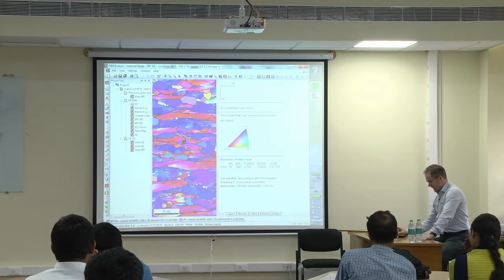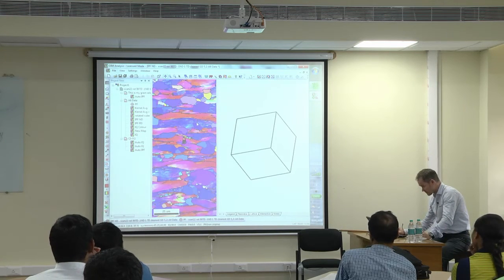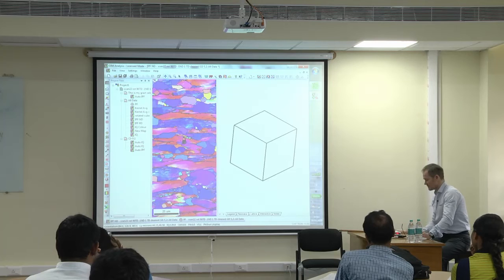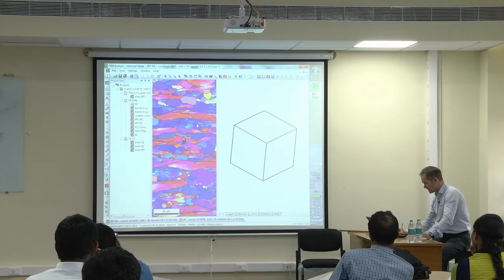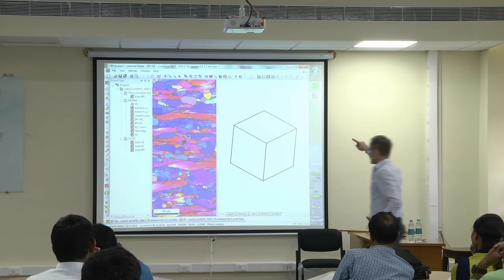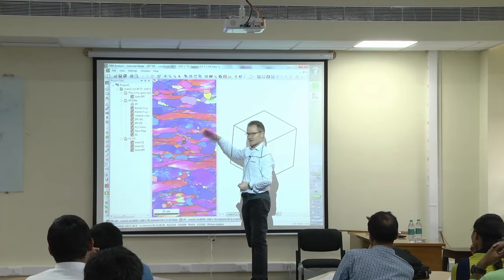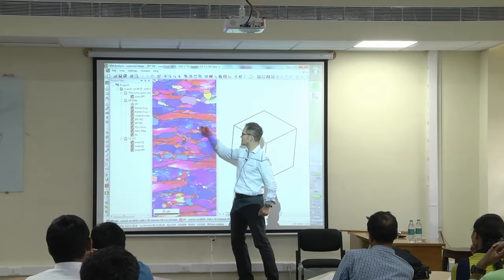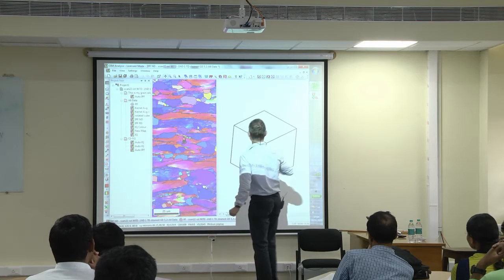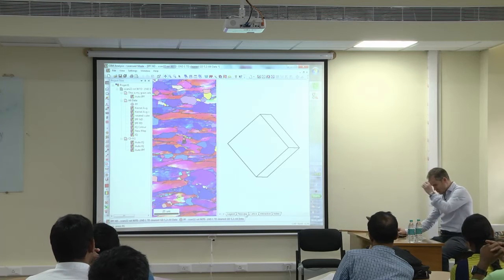Let's hope that I'm not confusing myself. Now it's, what am I showing here? Okay, I was not correct. And why not? Because the coloring which I have taken here is, so I have rotated the data, but the coloring is rotating it, so to say, back. The coloring shows really what kind of crystal orientation points out here. Yeah? So that should be somewhere written in the legend. Now I'm well able to confuse you.